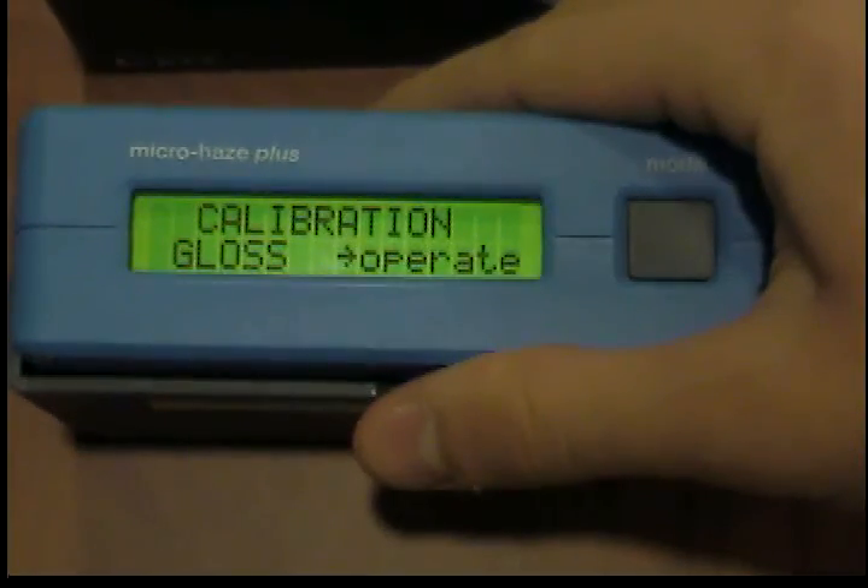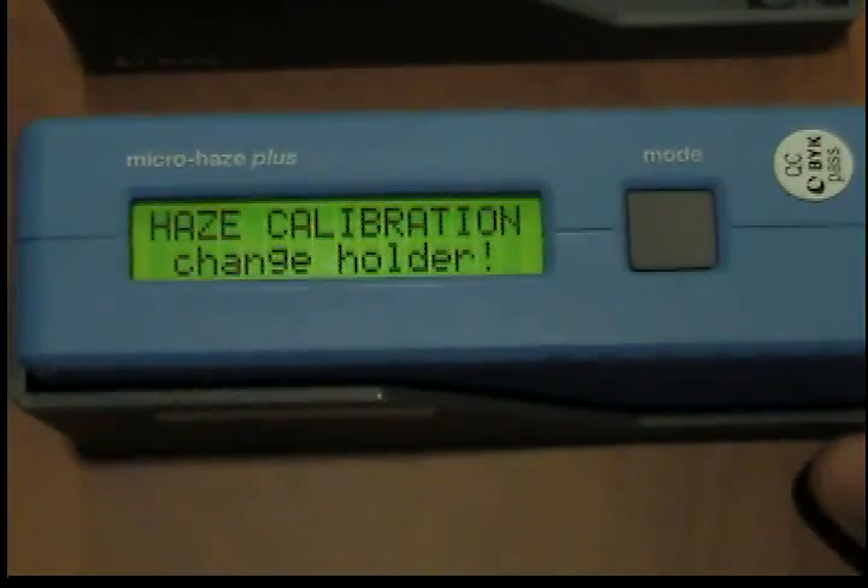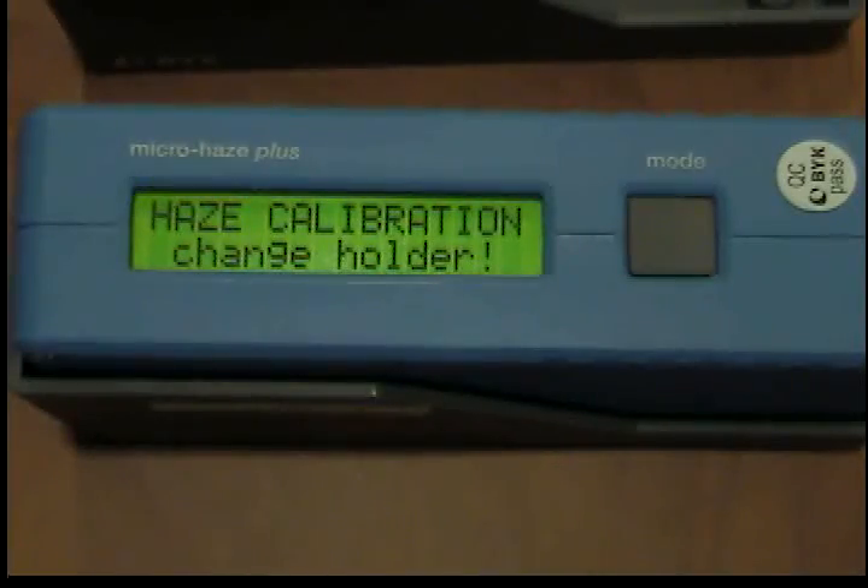First, the gloss calibration is performed. Please ensure that the displayed values correspond to those printed on the calibration standard, to avoid confusion of standards or unintended change of calibration values.